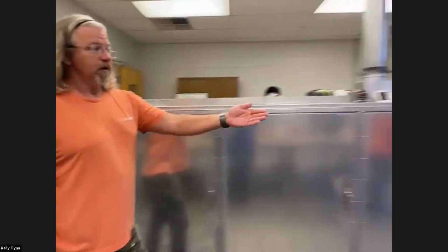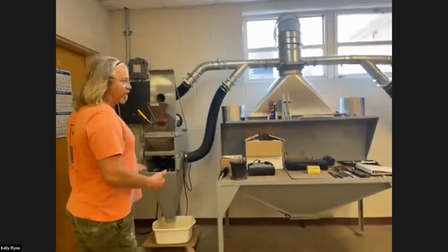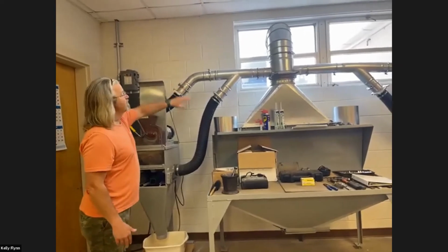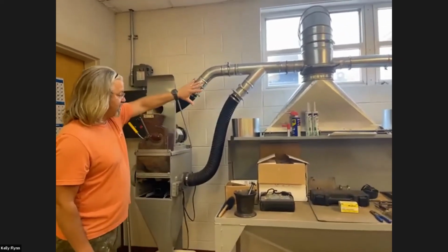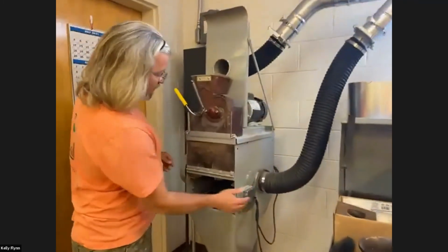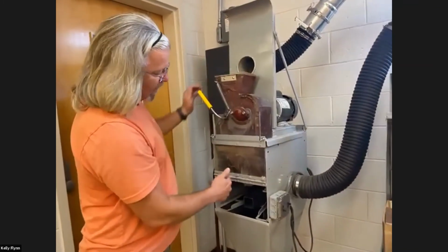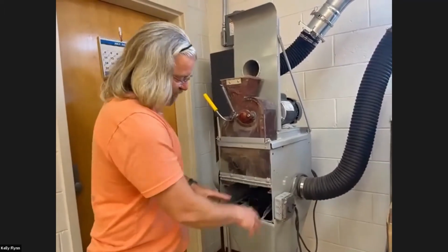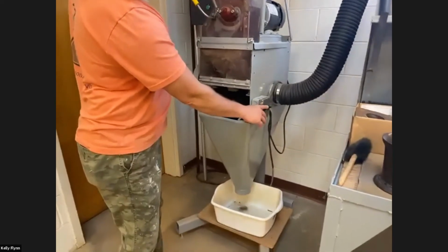Over here are our 2 grinders. We don't have them named yet, but these are the grinders. There's a hopper here. There's an air filtration system that pulls out all the silica dust. And we wear hearing protection and goggles, and they're not that loud. So there's a shaker here that when the soil passes through, it gets ground. The roots and rocks and other things that aren't soil get chafed out and go down to the bottom. And that's actually the grinder mechanism.